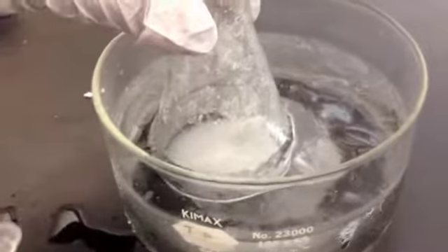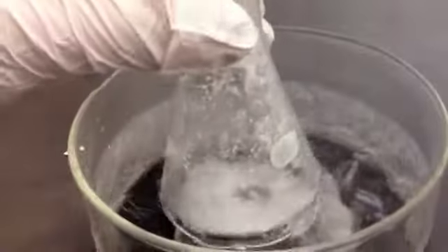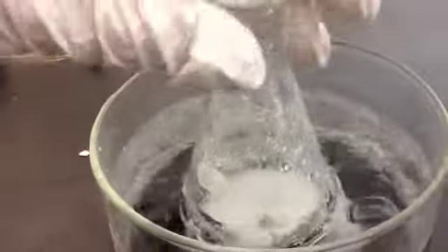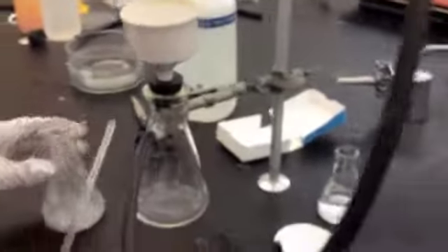Alright, so after about 5 minutes of staying in the ice bath, the product started to recrystallize, as you can see the precipitate on the bottom. So what we're going to do now is filter it, because there is still some ethanol in there that we need to get rid of. So let's move over here to the filter.